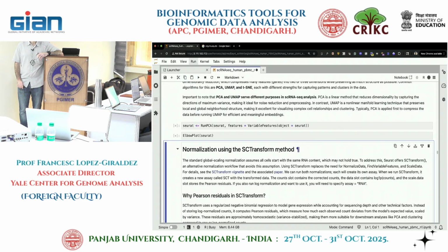We are not going to plot the PCA because it's not going to give you much information. Again, the PCA is a linear process, and it's not going to represent the data that well. That's why we use UMAP. But as a pre-step to UMAP or tSNE, you reduce the dimensions more with the PCA to make everything more manageable.